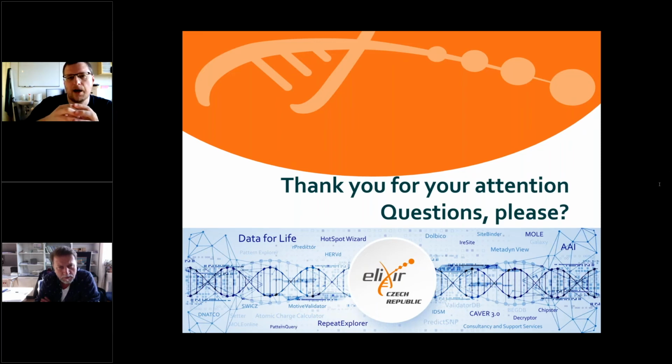Because if the ligand is large, then it also inflates the channels leading to the active site. So the apo structure usually has quite small channels, and those channels can be opened by the ligand which is passing. So the variation can be quite big, and it's important therefore to look for the channels that are staying in the structures or that are opening by the movement of the ligand.